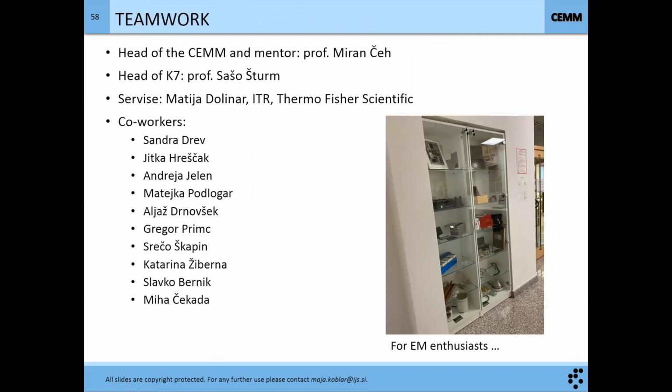This is the time to say thank you to everyone that helped me learn more about the SEM. And for those who will be starting the trainings, we also have our old microscope, with all the parts that you can see. If you want to learn more, just tell me, and we can go through all the parts: the gun, the aperture, the stigmators.